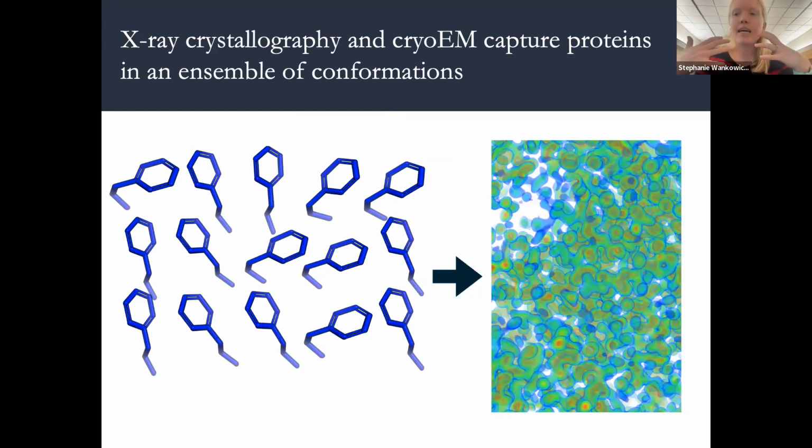So this electron density has all the information of the structural ensemble of these side chains and proteins, but it also has tons of experimental noise. It also has information about solvents, about ligands, about anything else that's occurring in the experiment. And so to be able to understand the signal that comes from the structural ensemble and peel that away from the experimental noise is incredibly difficult.